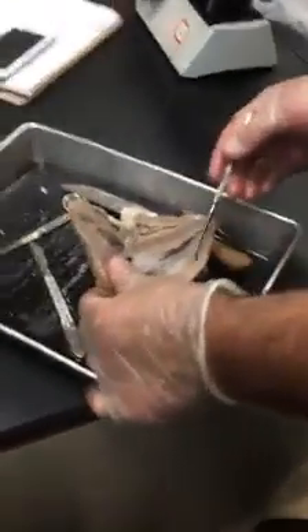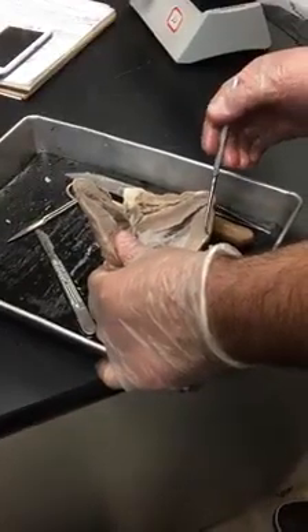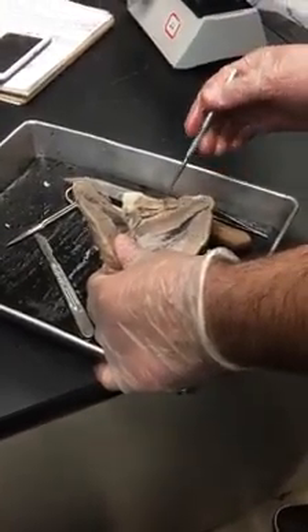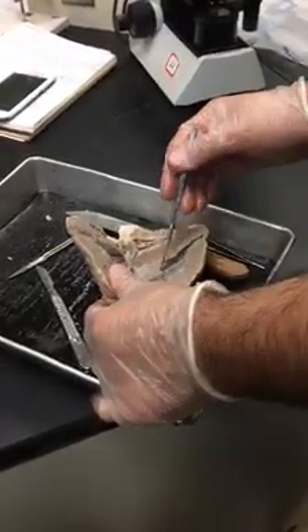The thickness of the walls helps us identify left versus right. Based on the distance from here to here and from here to here, this is the left because it's thicker. Now notice the size of the right and left ventricle.